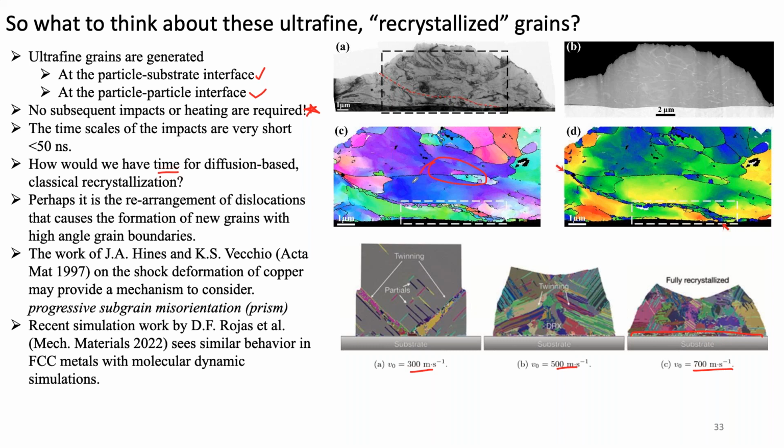A follow-up comment about the polishing. Someone has piped in that the multi-beam ion polishings do work well for those cross sections, so for big areas. When they say multi-beam, do you think they mean broad beam? I don't quite know what they mean by multi-beam. I think they mean the broad beam. Okay, yeah, that's good to know, because I think that's a great idea.